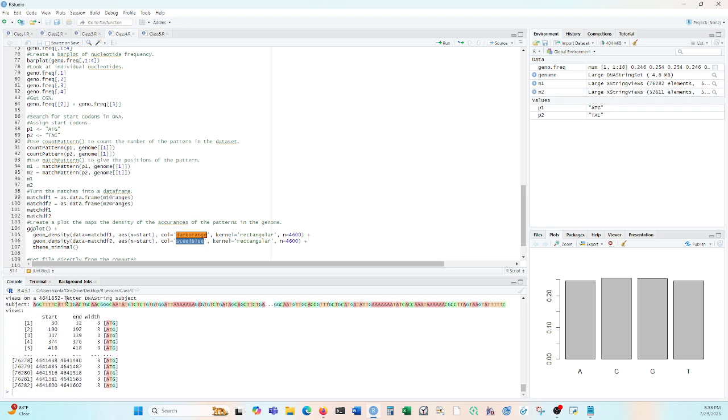And now let's look at it, and you can see here for the ATG, it finds it in this position. So it starts at 30 and at 32, and that makes sense. And with 3, and it keeps on going down, down, down. It creates this very long table, and it indicates all the places it is, and it's so much that it doesn't show you all of it because it's too much, but it does. This is good data.